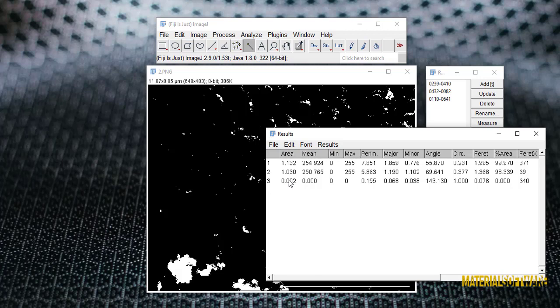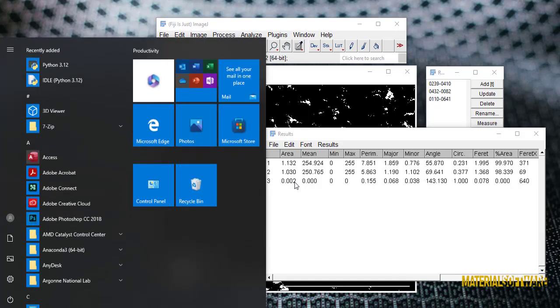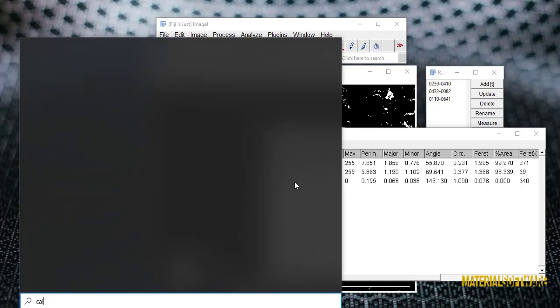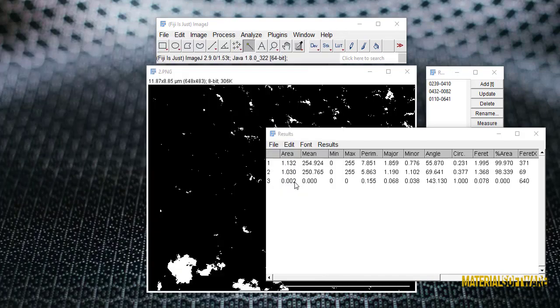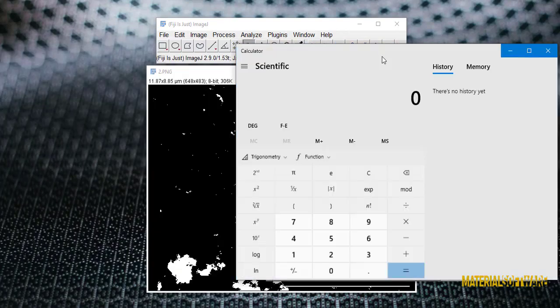I divide it by the total area of the image. The area of the image is at the top of the image. We can get the percentage of porosities.